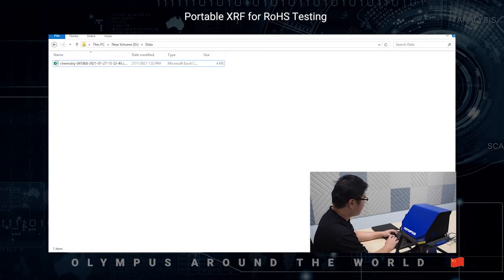Then you will be able to see the export file in the folder. The Vanta XRF comes with optional methods such as coating for plating thickness measurement, and alloy plus for alloy grade determination, such as stainless steel 316, 304, Inconels, brass, etc.